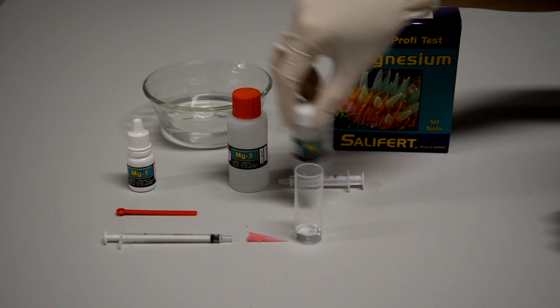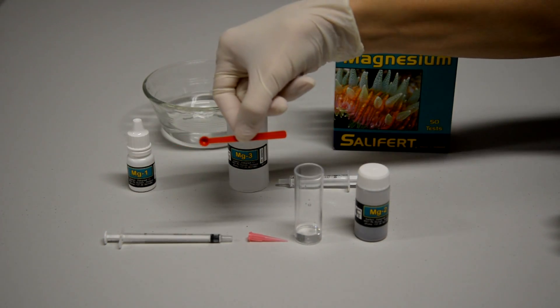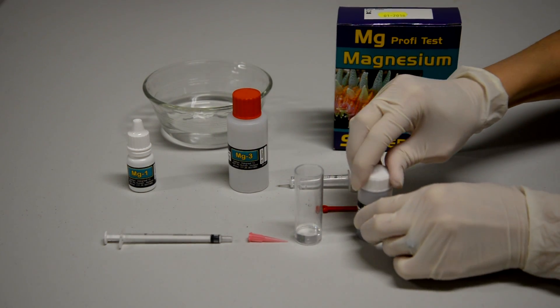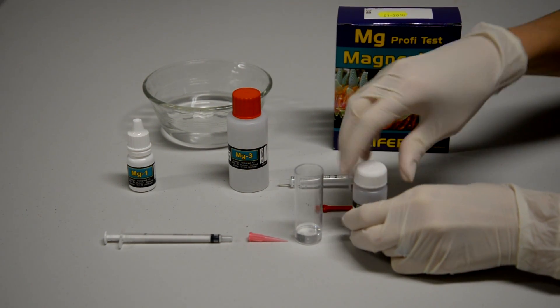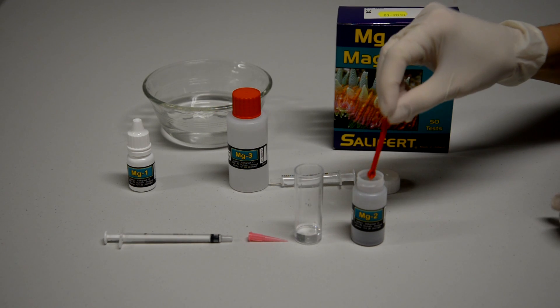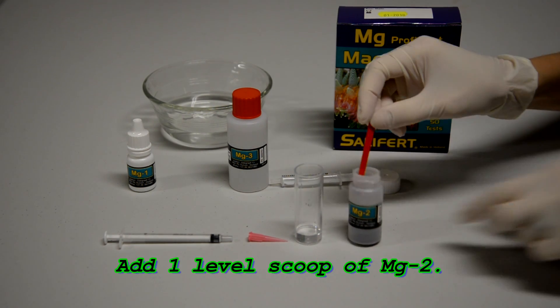Then we go on to magnesium 2. They give you a nice little measuring spoon here that you're going to want to fill just to the top, make it a level spoonful of your magnesium 2 powder.